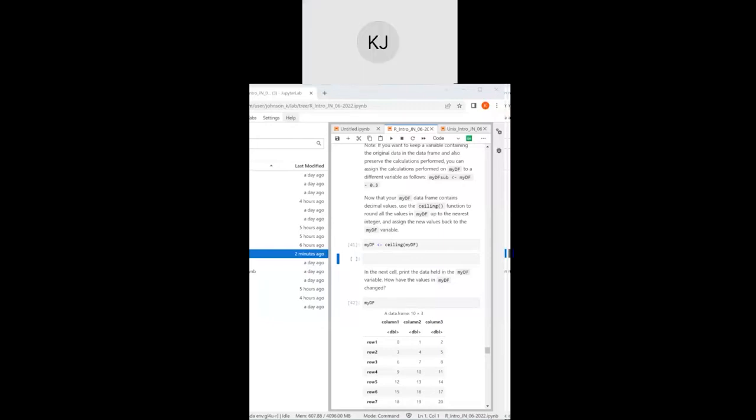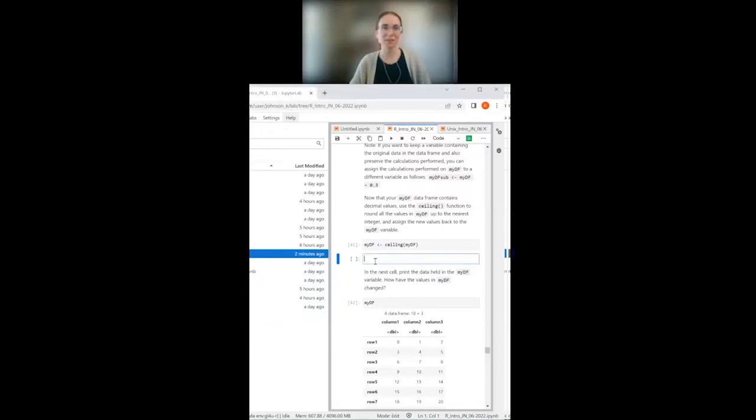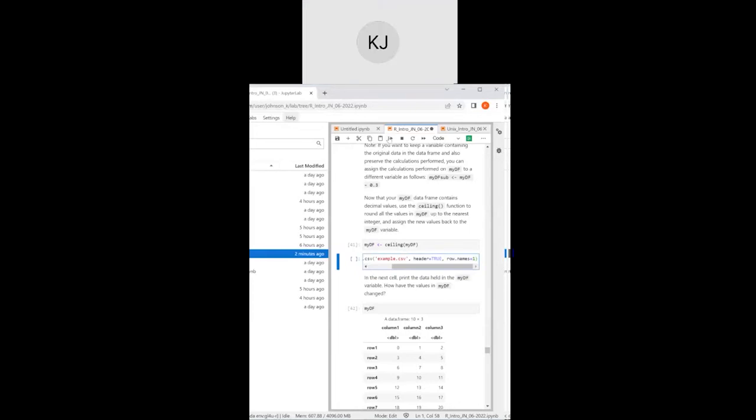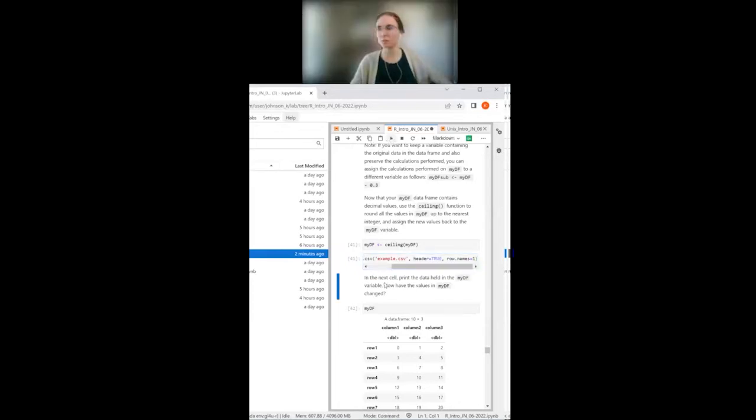Okay, so stick that in your empty cell there, run that, and then run the next one. And let's just make sure we're back to normal. Okay, great. Perfect.